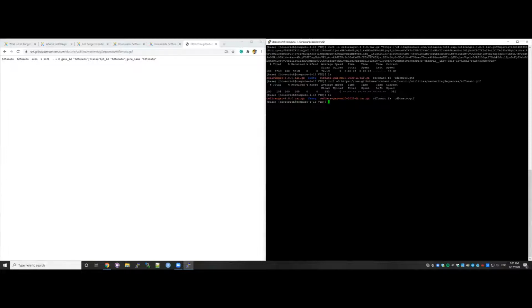Okay. So we are taking the reference that Cell Ranger provides, and we are going to personalize it to create a new one. So that reference is the genome FASTA file and GTF? Yes, but it's the genome without the tdTomato gene. Yeah, so the tdTomato you're going to add is another contig or another chromosome? I'm going to add another chromosome, yes. Okay, I see. So I am going to uncompress this.